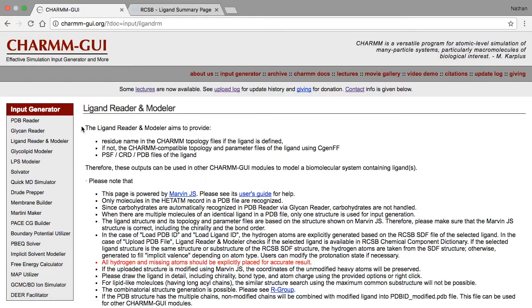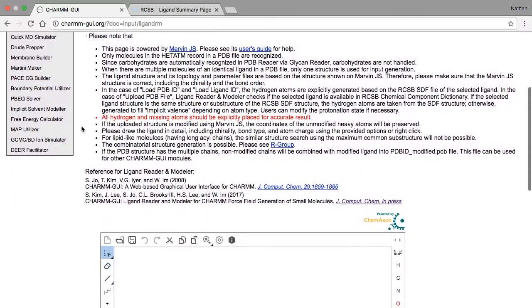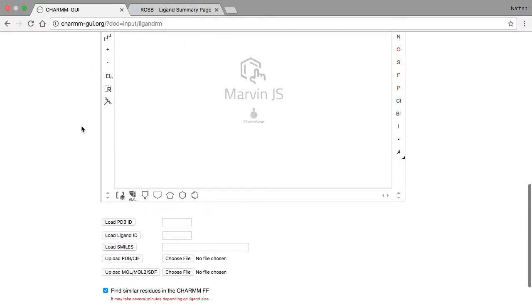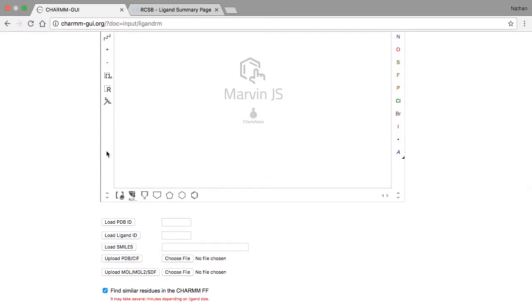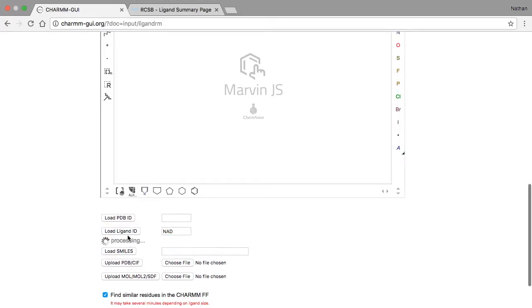As we saw earlier, LigandReader and Modeler uses the molecular structure for the corresponding ligand entry from RCSB. If we already know the name of the ligand in the RCSB ligand database, we can simply enter it in the LigandID text box. In this case, the LigandID is NAD, so we'll type that in and click Load LigandID.